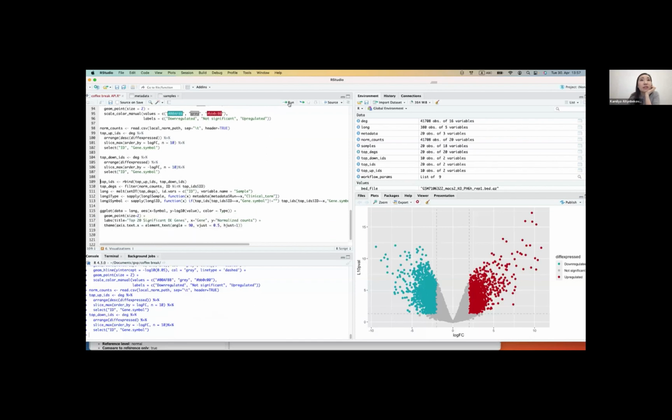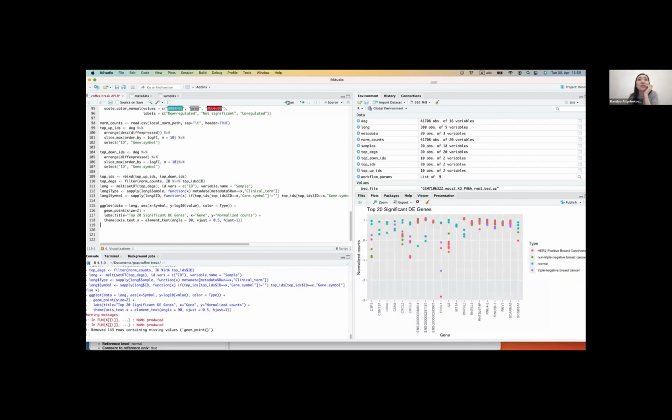And I want to also visualize them. Again, I will not go into detail on the R. This is just R commands, and again, some plot. Here is also another example of how you can visualize.